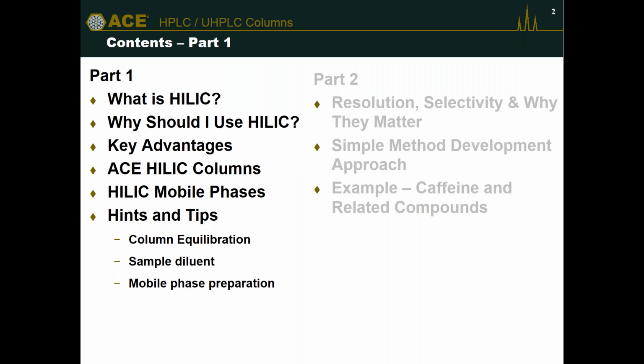When we consider HILIC mobile phases, what is the composition of these mobile phases? Why are they based on the different solvent systems that they are based on? I'm going to talk a bit about that today too. And then a variety of hints and tips are topics I'm also going to cover. And there's probably two topics which I think float to the top of being the most important for HILIC as a practicing chromatographer that you need to consider when you're using HILIC as a technique, or if you're developing HILIC methods. First of all is column equilibration.